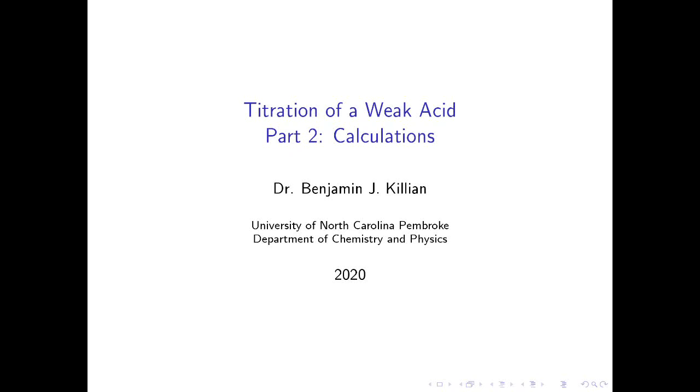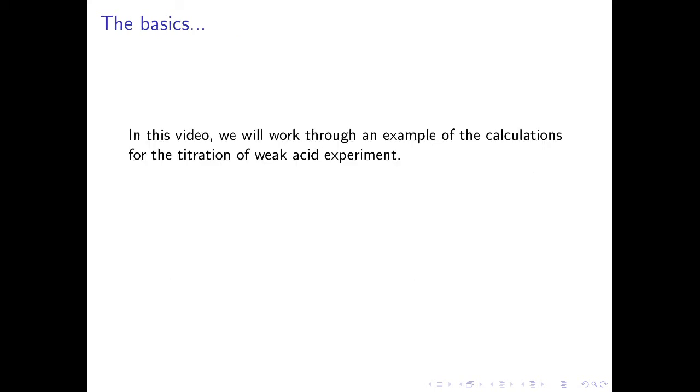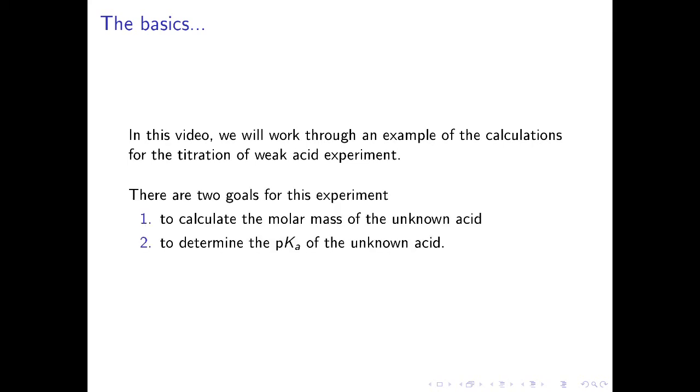In this video, we will demonstrate the calculations for the titration of a weak acid experiment. We will work through an example calculation for the titration of a weak acid experiment. Please be aware that the data we are using in this calculation are not the same as those from the actual experiment.